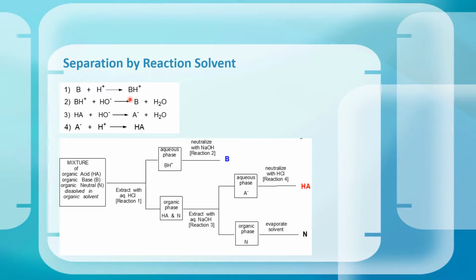You kind of want a gradual sort of change so you can get multiple extractions out of it. It just depends on the situation though. It depends on the specific experiment. But these general equations remind you how the acids and bases are traded off, and it shows you basically the process going on with what's happening at the functional group in question. And all of this will be decided by the pKa. So that's an important thing to keep up with when you're talking about extraction stuff, is looking at your pKa's and seeing which will happen first.